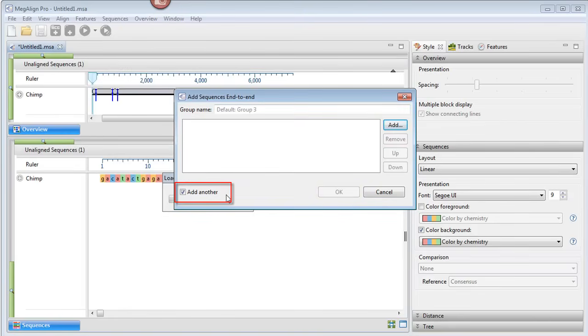Because the Add Another button was checked, the dialog opens again automatically, so we can add the next group of files.